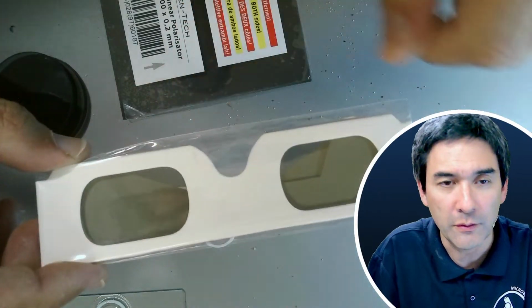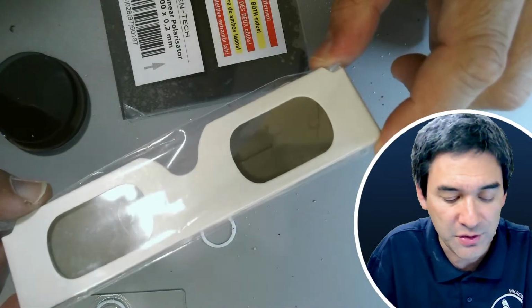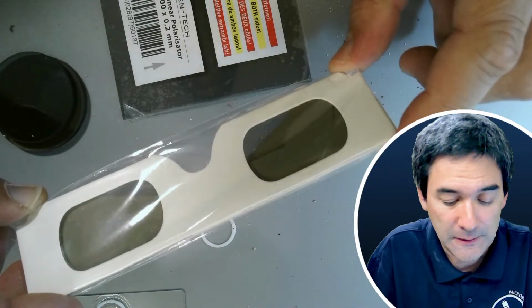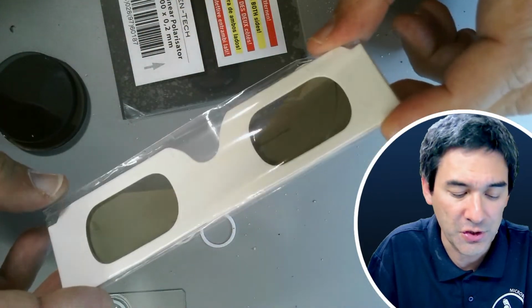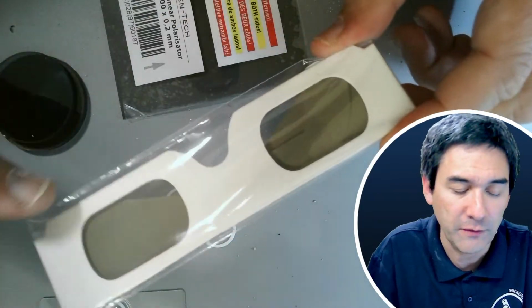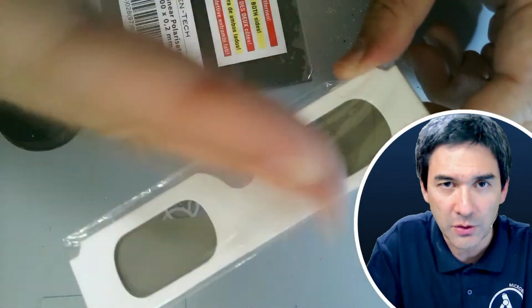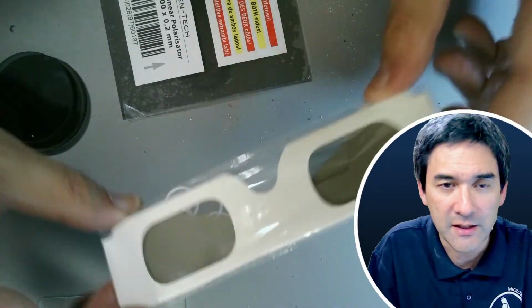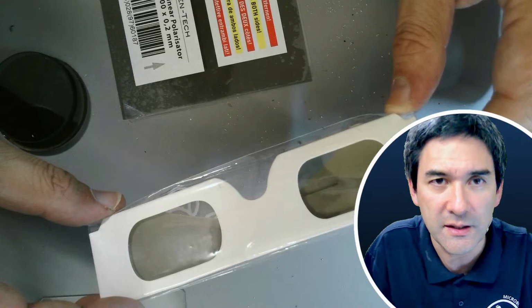They use polarized filters, but I do not recommend them. I do not recommend them because these are circular polarizing filters, and then you need the correct orientation. Some of them don't work properly because you have to have two matching filters, and not only the degrees are important, but also the orientation. So while this is possible, there are easier ways, let's put it this way.